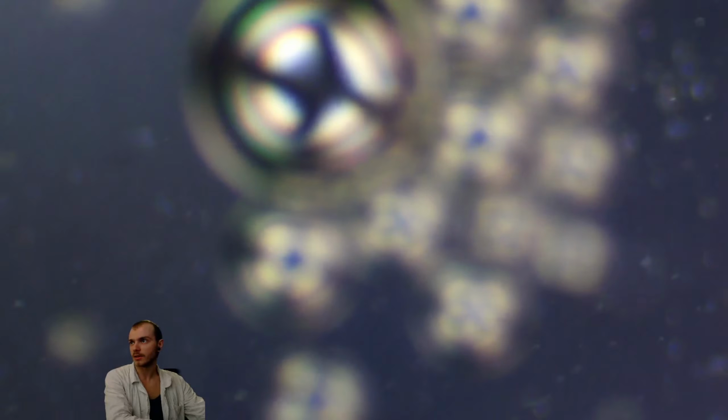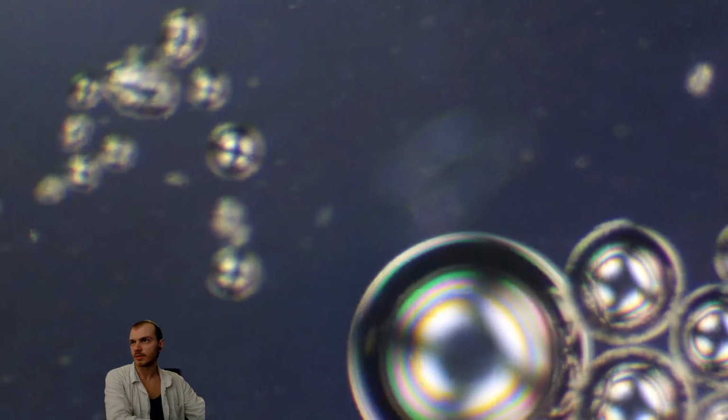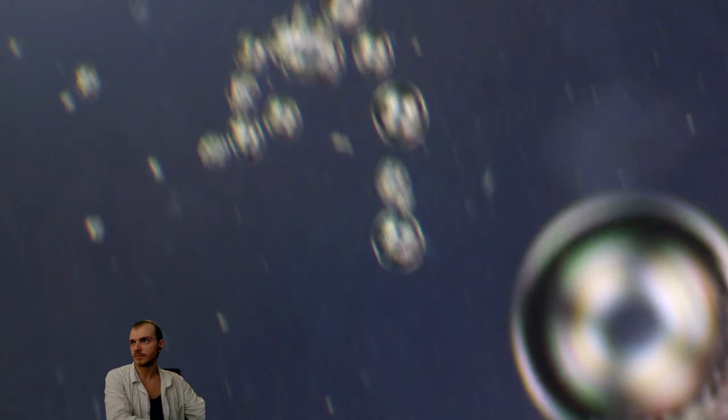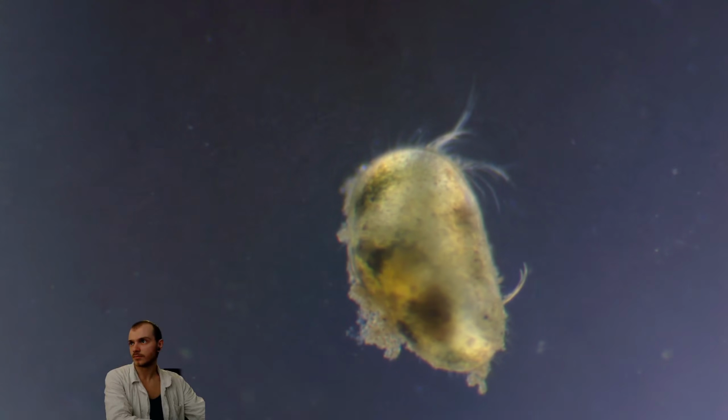They eat a lot of algae, as I remember correctly. Those are just bubbles, right? Yeah, this is an ostracod. That was a nice view.